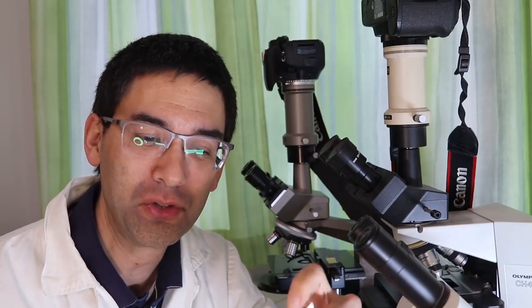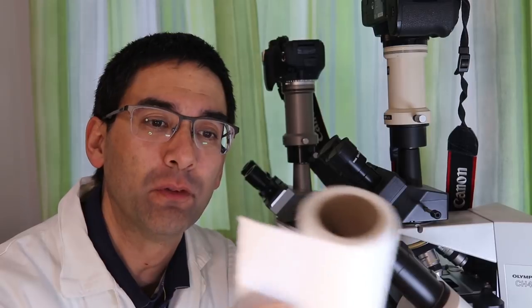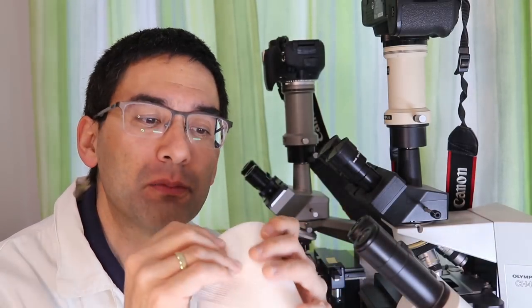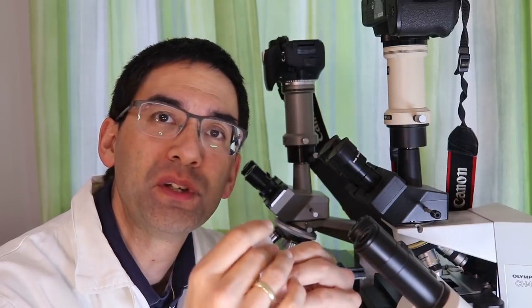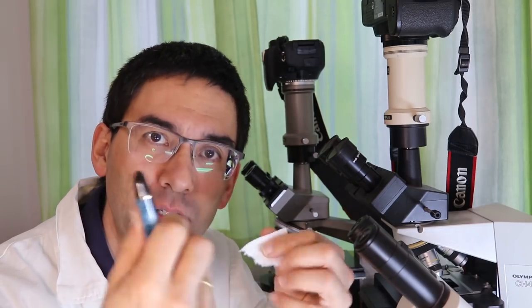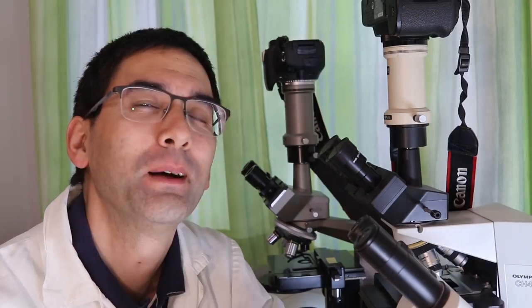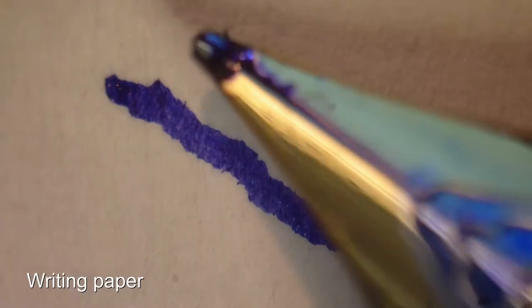Yeah, so as I just told you, I used different types of paper, and what I did is the following. I observed capillary action. So there are very small microscopic fibers in paper like this, and of course they soak up water, and because the ink is water-based, it also soaks up the ink, and you can actually see how the ink spreads along the fibers. So let's just roll the music and you can enjoy pen and paper.